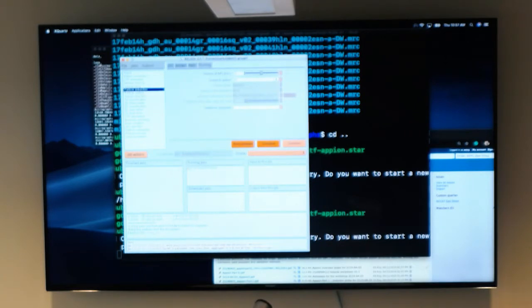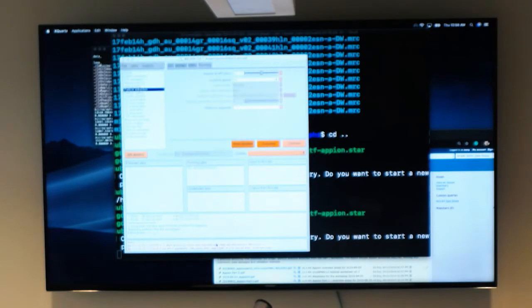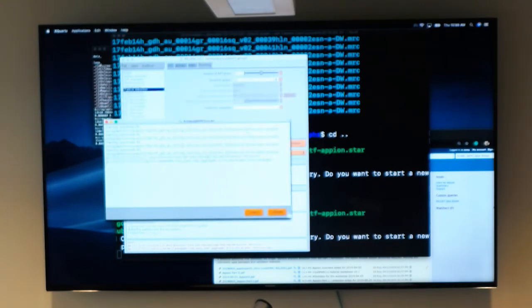In this panel, you see the number of jobs that are running. If you double click on here, this is a text file of the run.out, and it'll give you an indication of the output of it running. If there are any errors, they would pop up here. And there are certain known errors. For example, not every micrograph has a box file. Certain things are errors that are not gating, and it'll still continue, and you'll see that here.